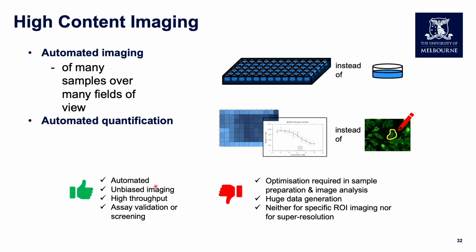So the pros are automation, unbiased imaging, high throughput. We can do assay validation and screening. Lots of people here are doing drug studies or multiple different treatments to try and look at combinations that work.